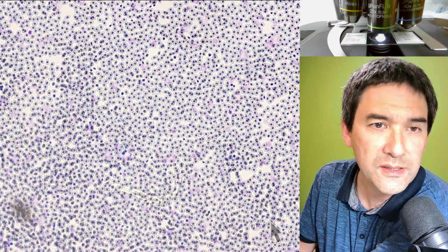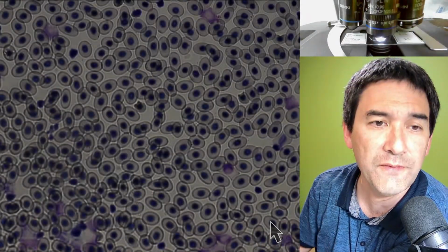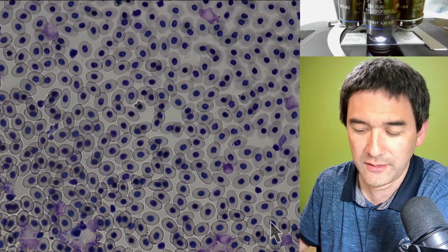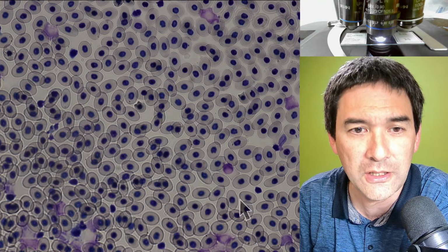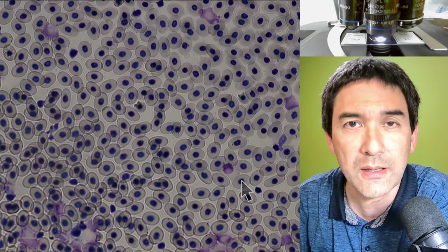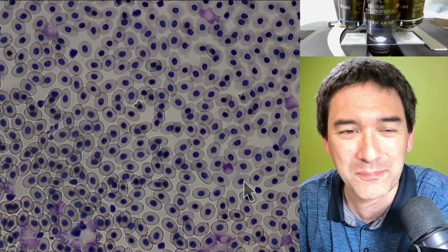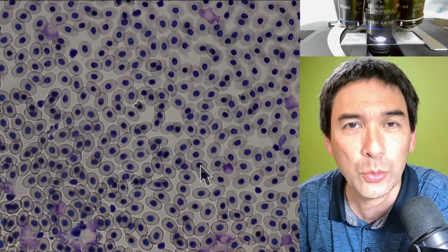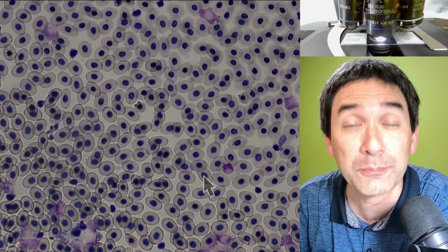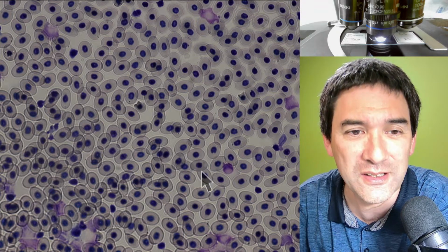Okay, here again, these are red blood cells of a frog. Let's go up again. And here we already see a very, very important difference. You see that there's a dark dot in each one of them. That's the nucleus. So the red blood cells of frogs and amphibians have a nucleus, and the blood of mammals, like us humans, does not have a nucleus. During the formation of the red blood cells, the nucleus is lost and the space is used for hemoglobin, the protein that carries oxygen, right? And in amphibians, the nucleus is still present, and here they stain it and you can still see it.